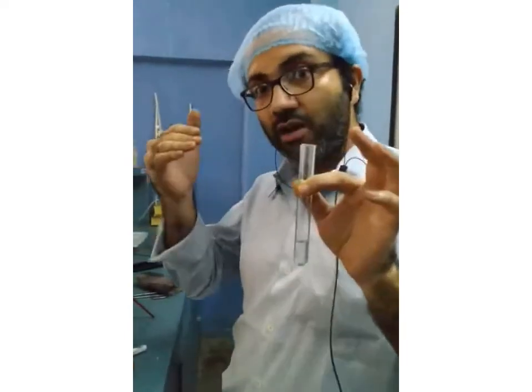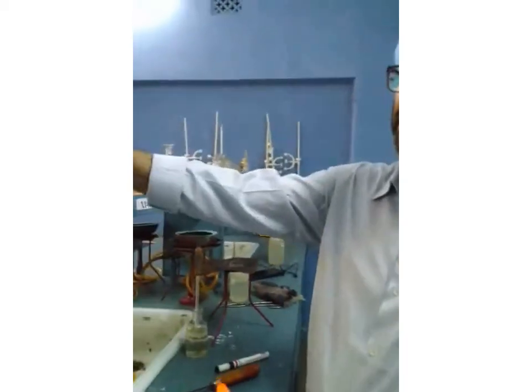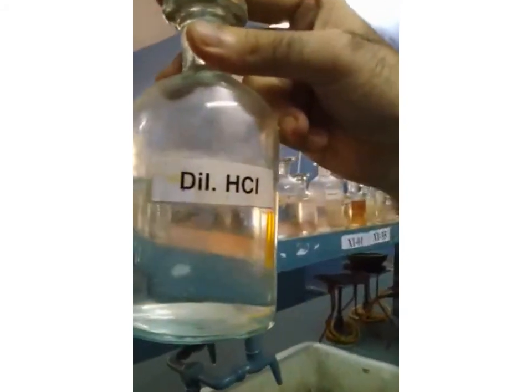I have to start accordingly. I have to start with group 0, followed by group 1, group 2, group 3, and accordingly we will move on simultaneously, sequence-wise. The reagent of group 1 is dilute hydrochloric acid. This is the reagent of group 1.